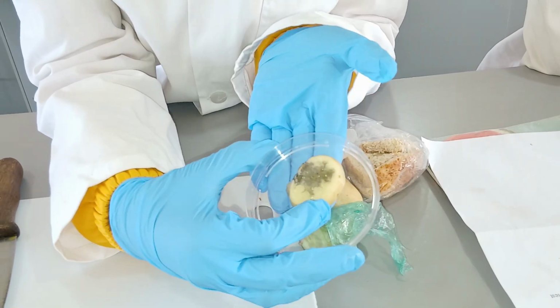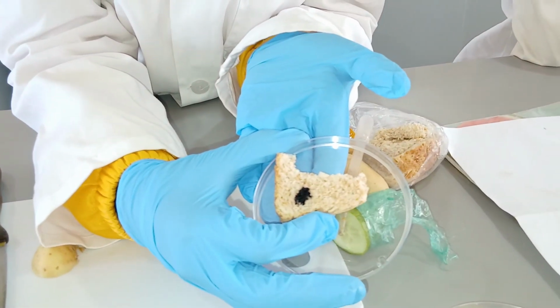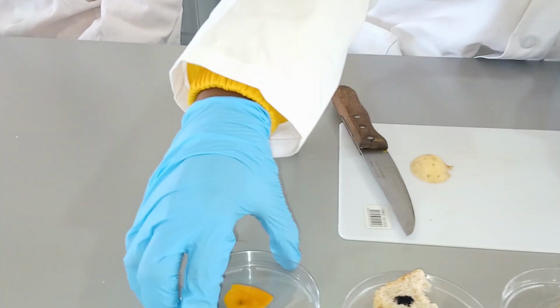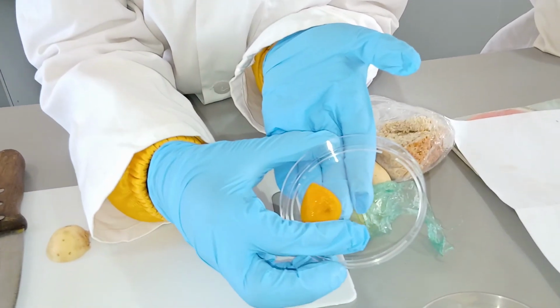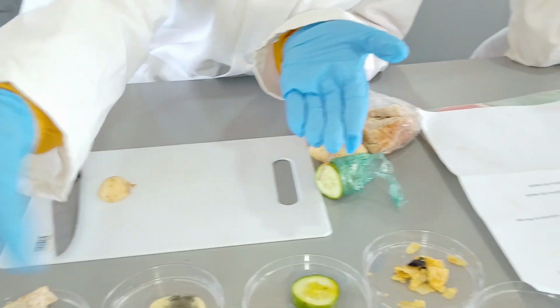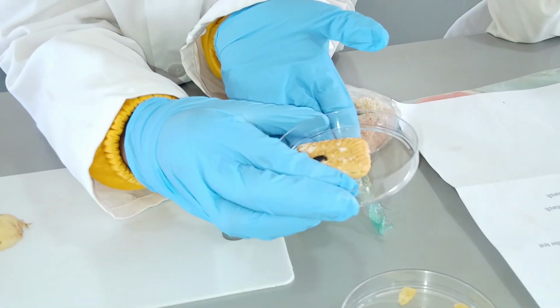Here we have a potato which has turned black, which means that there's presence of starch. And here we have our brown bread. The color has turned blue-black, which means that there's presence of starch. And here our mango has not changed color, or it has a bit of color change, but then it does not contain starch. Here we have our biscuit, which has changed color into dark blue, which means that there's presence of starch.